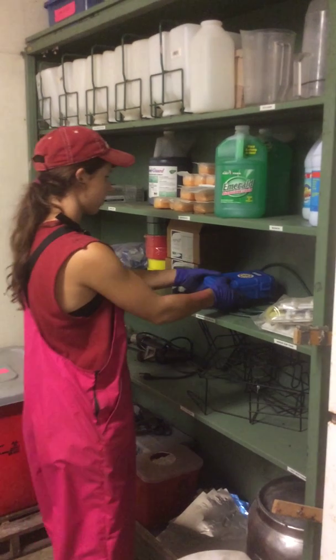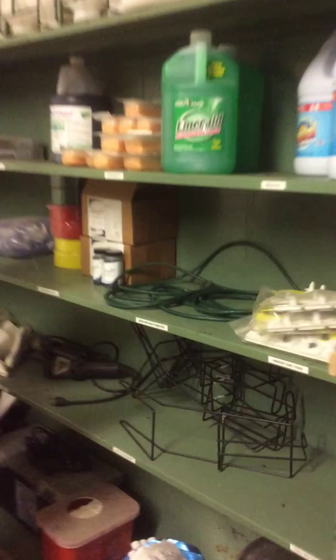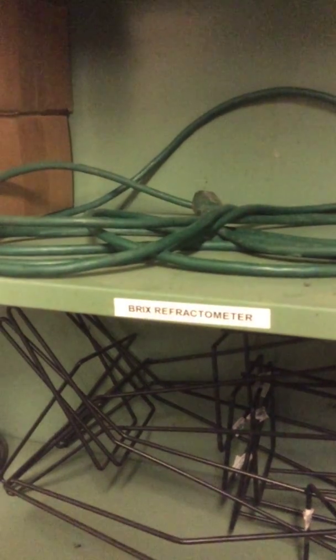When doing a Brix reading test of new colostrum, come into the CAF room where you will find the Brix refractometer on the shelf.